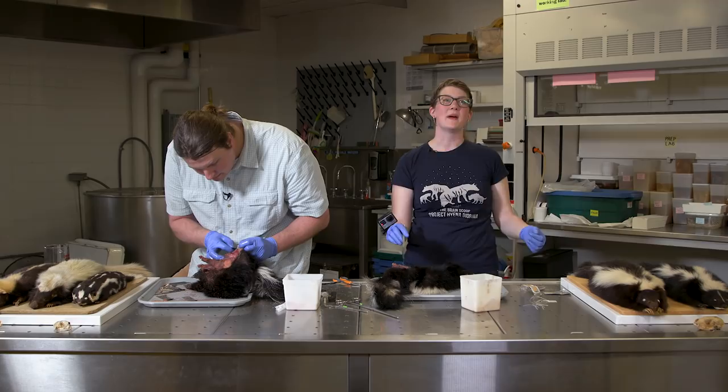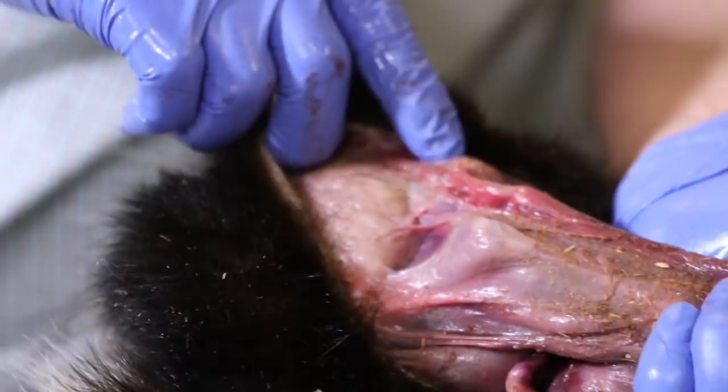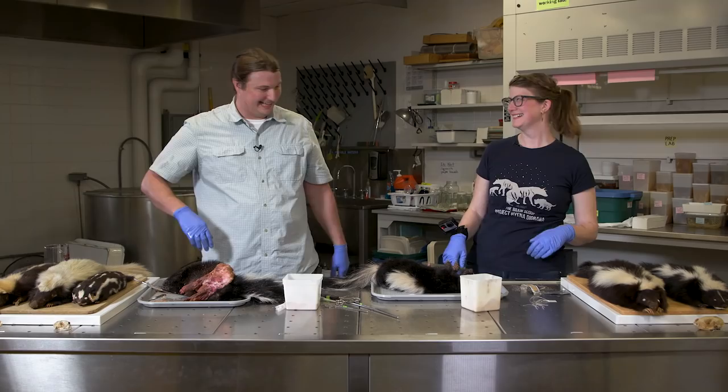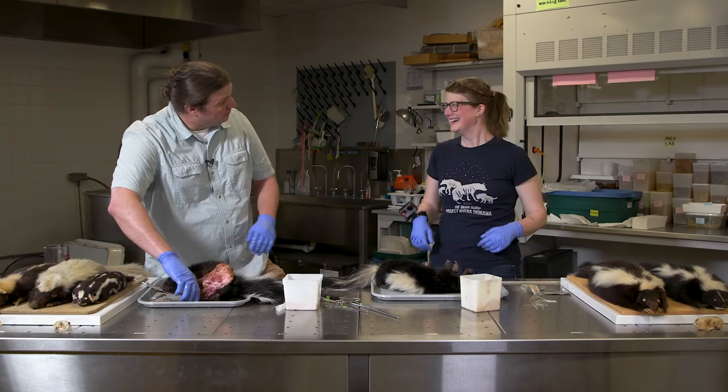I'm not sure where I'm cutting now — I thought I knew where the glands would be and now I don't. There's your gland — that is huge! Now we just need to find the other one. I got a whiff of that one — that's a loaded one.